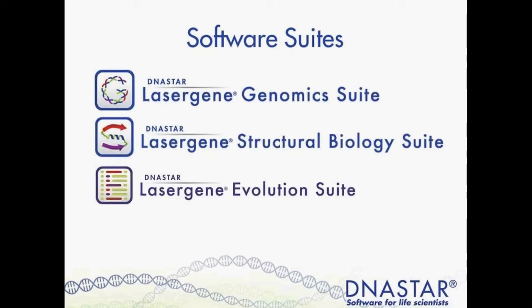Here at DNASTAR, we also offer 3 different suites or software packages for different areas of research. Lasergene 12, which is coming soon, offers significant enhancements to these different suites. Now, the Lasergene Genomics Suite provides all of the software necessary for next-gen sequence assembly and analysis. With the release of Lasergene 12, several new workflows in Lasergene Genomics Suite are going to be introduced, including enhanced SNP prediction accuracy as well as new gene panel workflows. I would encourage you to check out our website. We'll have a webinar later this month on those particular gene panel topics if that's something that interests you as well.